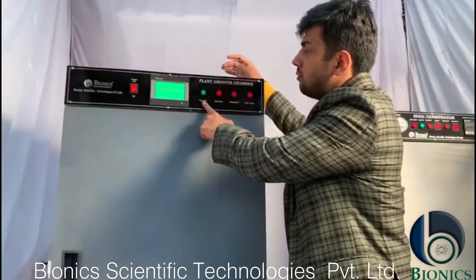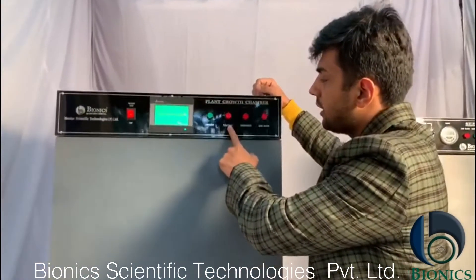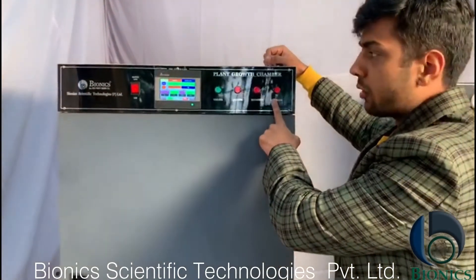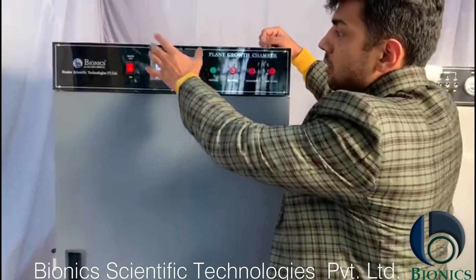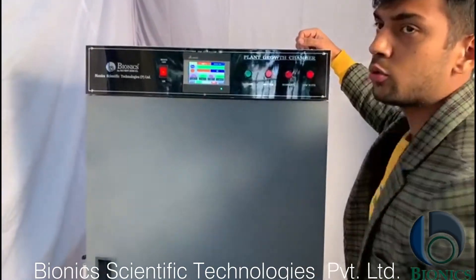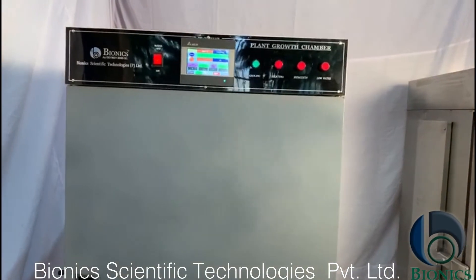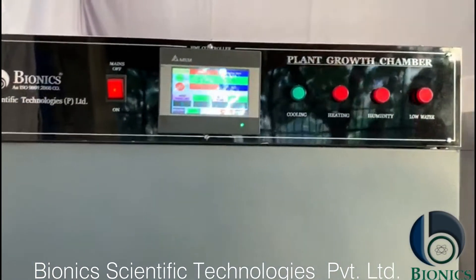This is the cooling indicator. This is the heating indicator. This is for humidity and this is for low water. This is your control panel through which you can control all your requirements.